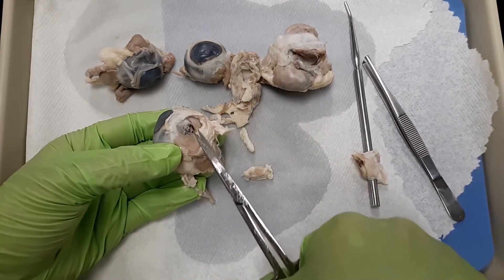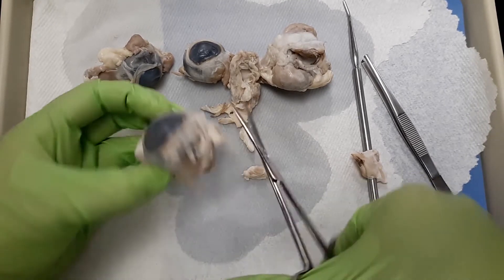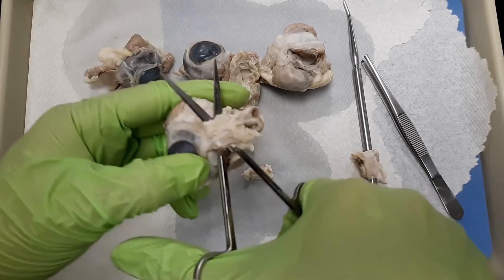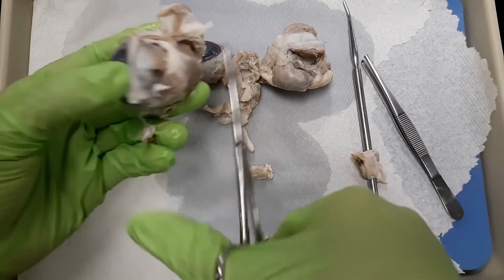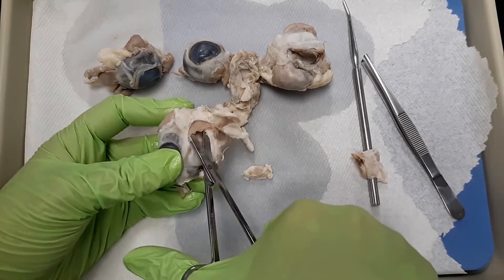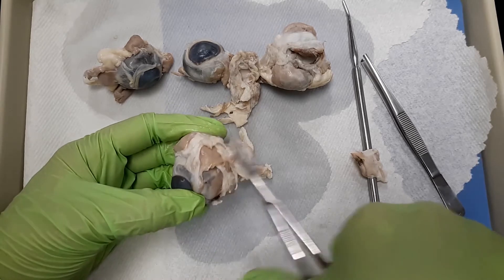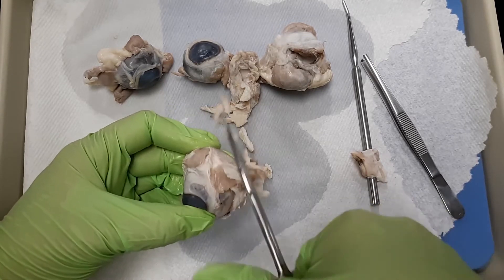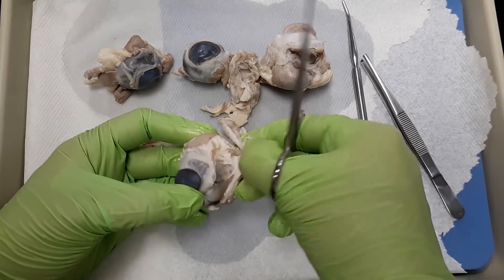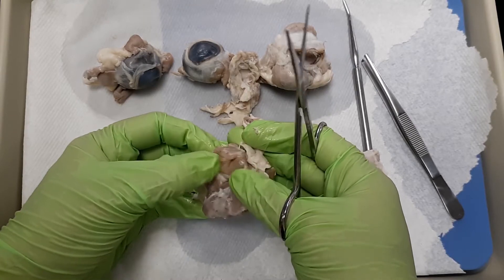A useful technique: sometimes you don't want to be stabbing in. Get your scissors, stick it under a layer, and spread — now I've gone through without stabbing into the eye and I've still kept the integrity of that structure. Sometimes you'll get scared and think you just cut into the choroid — that black layer — but you're okay. Keep cutting through; do the scissor spread technique and you'll keep cutting. I have some fat and fascia on top of that muscle right there. Now I'm going to chop it off — I'm still good, I haven't gotten to my optic nerve yet.